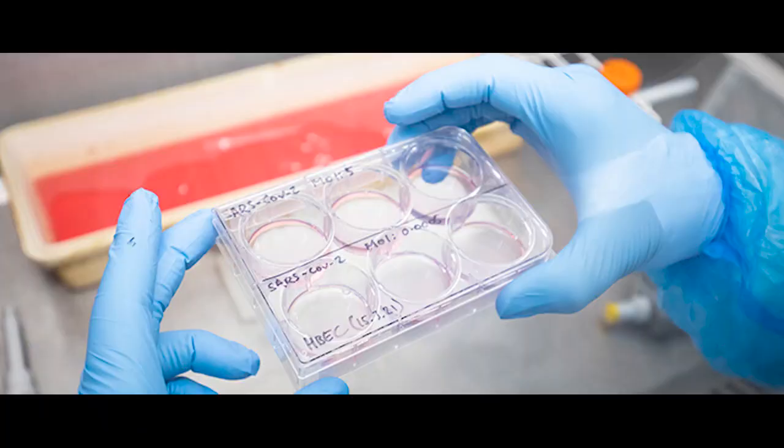COVID-19 Drug Screening and Resistance Hub, CRUSH in short, is a new facility here at the MRC-University of Glasgow Centre for Virus Research. CRUSH offers a service of testing and screening potential compounds against SARS coronavirus 2, which causes COVID-19. We can also test products for their ability to inactivate the virus. At the moment, we are primarily focusing on SARS-CoV-2, but in the future, we plan to expand and work on other viruses.